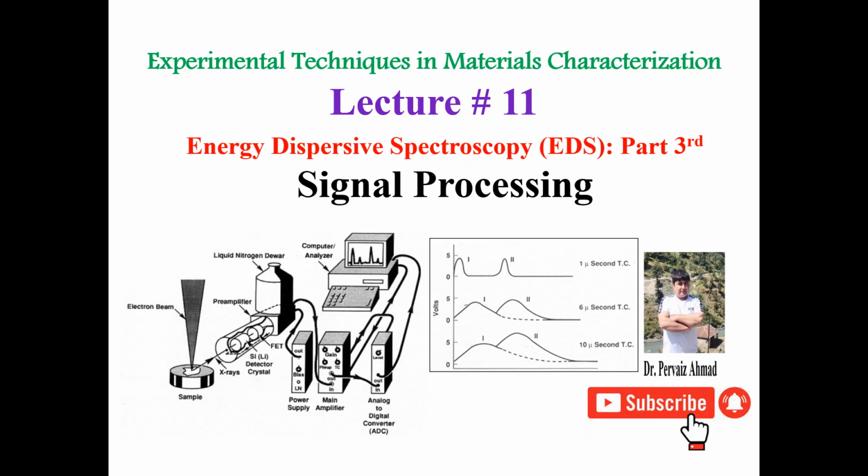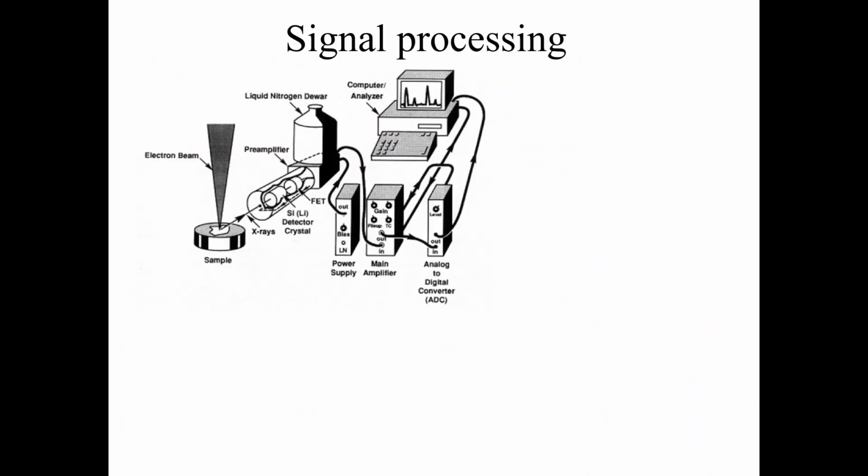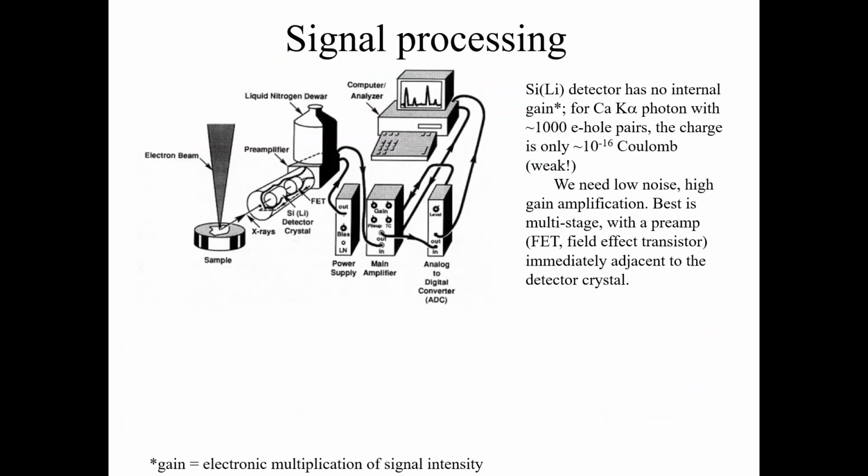I'm Dr. Ph.D. In this lecture, again, we will continue our discussion in part 3 on energy dispersive spectroscopy. Today's topic is signal processing. That is, in this lecture, we will discuss how the signals are processed toward the formation of the spectrum and the EDS analysis. So let's proceed towards today's lecture about signal processing.